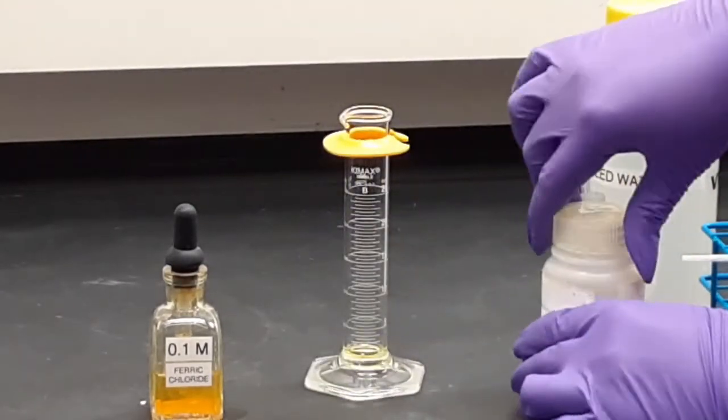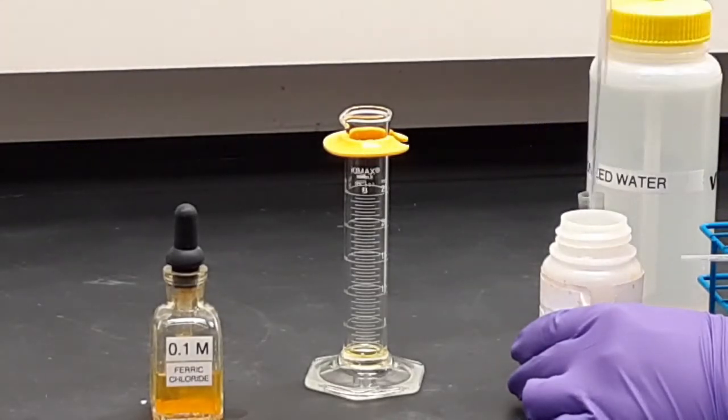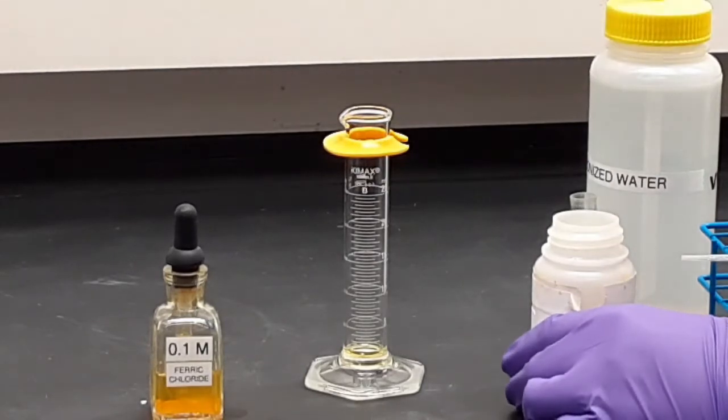And sodium thiocyanate is very much like potassium thiocyanate. The sodium and potassium really doesn't matter here. So we get much the same color change as you see in the equilibrium lab.